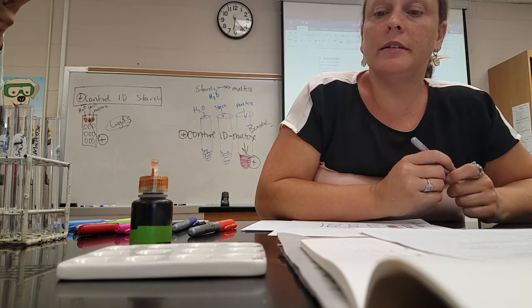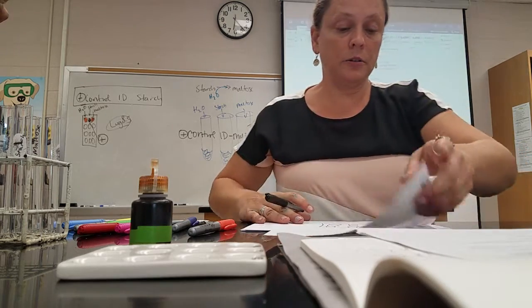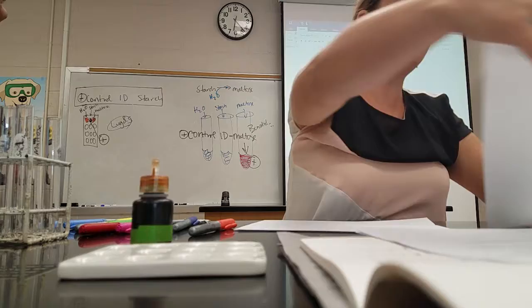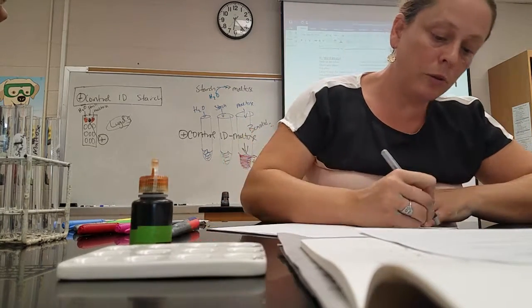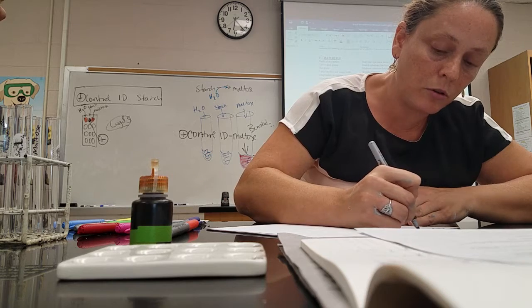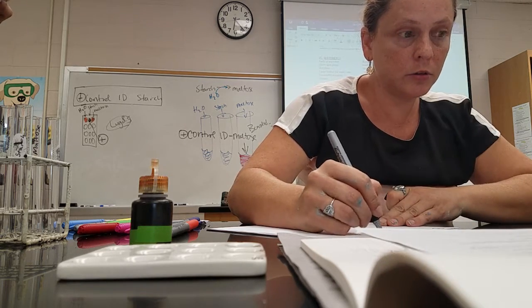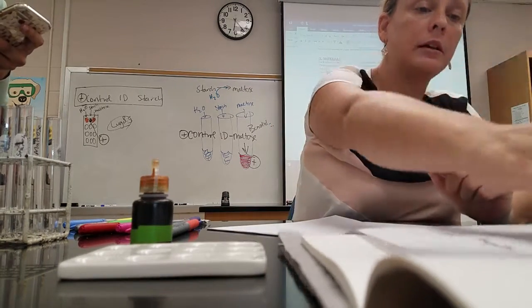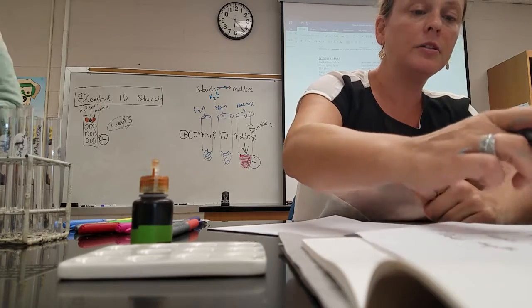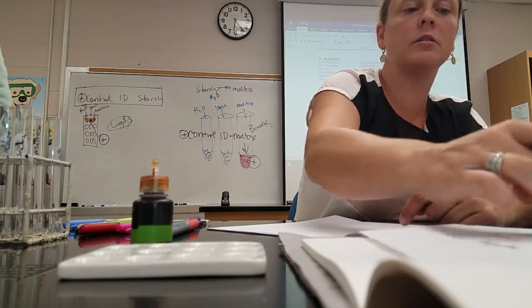Now how are we going to detect maltose at the end? Well, we're going to use Benedict's. The positive control for Lugol's we just did, but now we need to do what we call the positive control for maltose. So keep thinking, what is our big question today? Is starch breaking down to maltose? We do need water. These are your little variables that we don't know where they are because it's all clear.